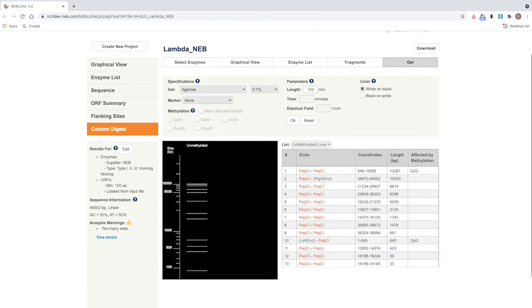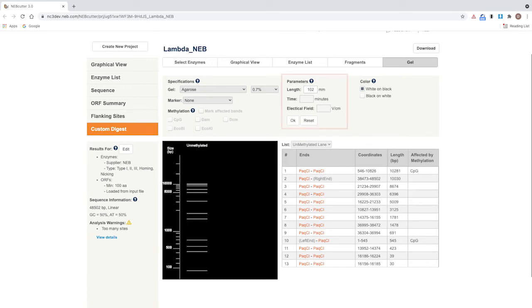You can input the length of your gel to better match your electrophoresis conditions. If you are using other gel systems, you can input your electrophoresis parameters corresponding to the conditions used with your electrophoresis setup.